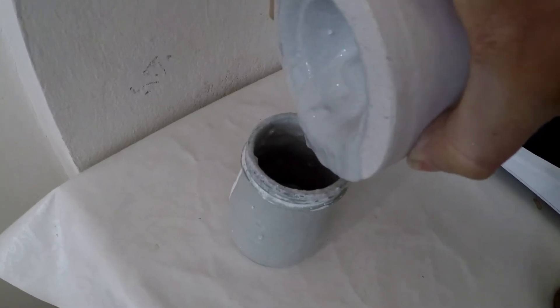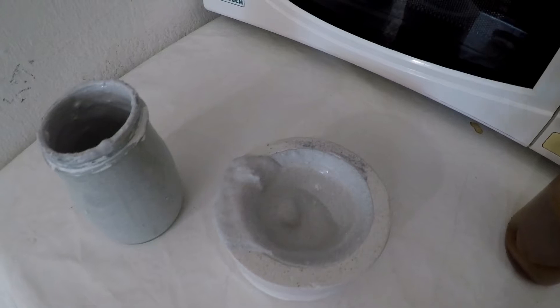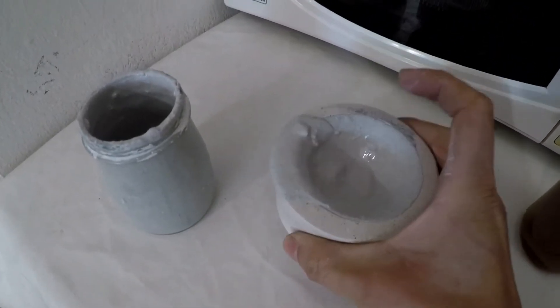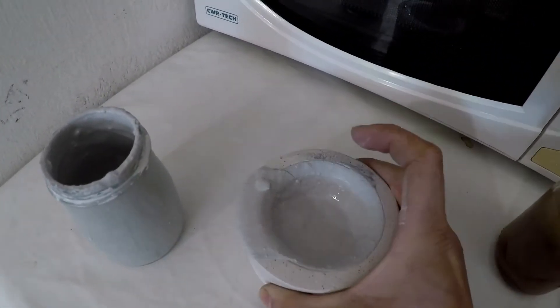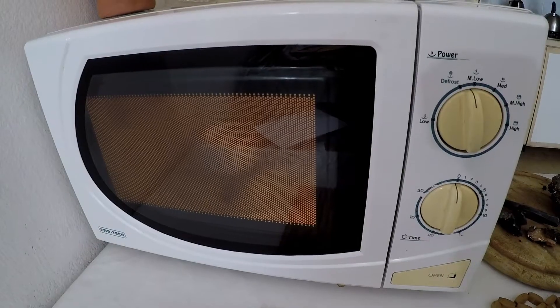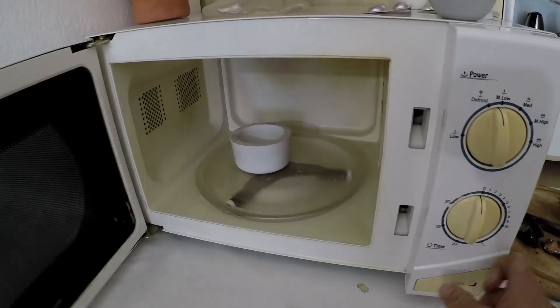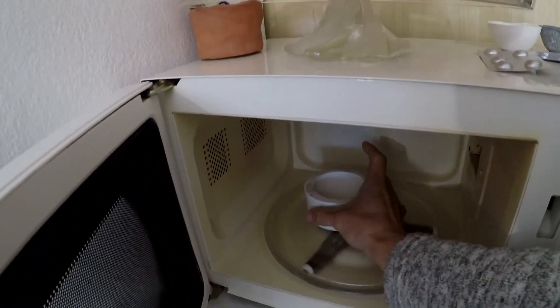At this point I really don't care about the insides because I'm testing the refractory properties of this mixture, but it's still better if it's well mixed. Then, while the mold is still wet, I place it into the microwave on medium to low heat for three to four minutes and repeat several times until it's dry.